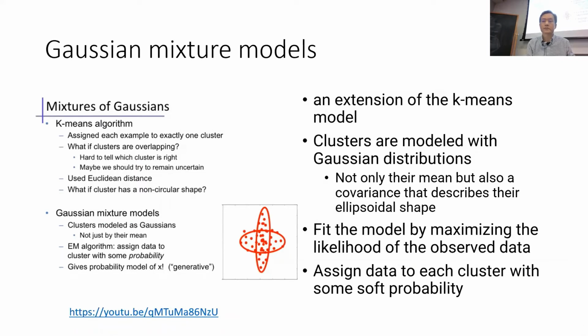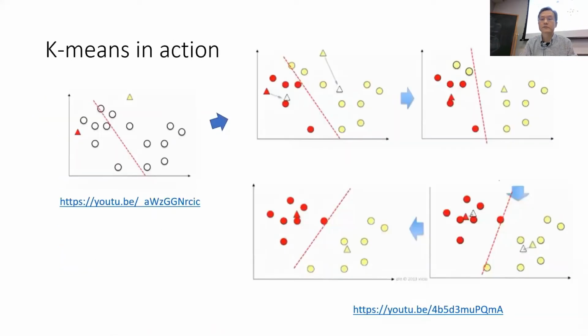So the membership is essentially based on the distance. When we're assigning names to our clusters, our cutoff line is essentially the genes that identify each cell type and how they're expressed within, like, neutrophils versus the others?